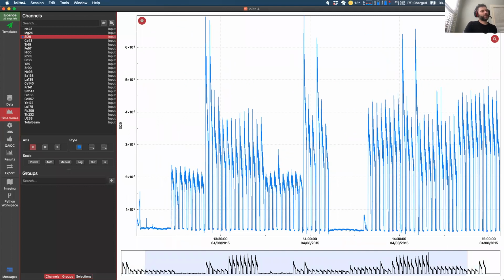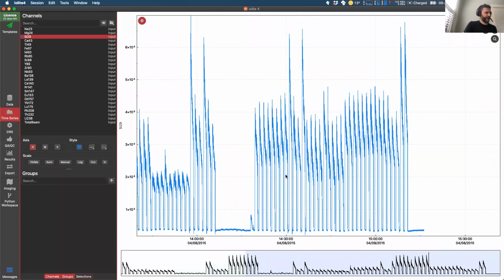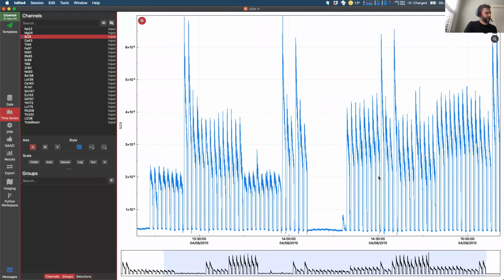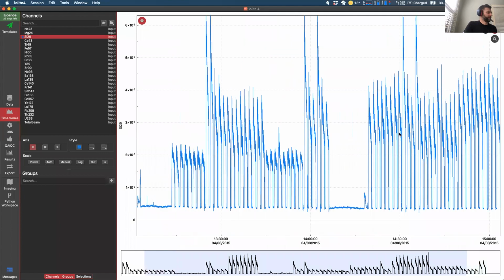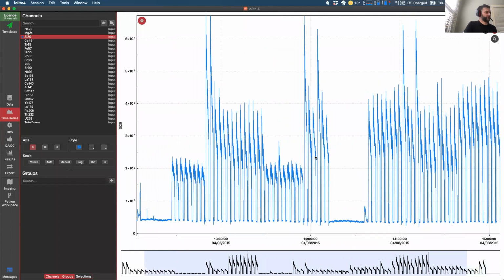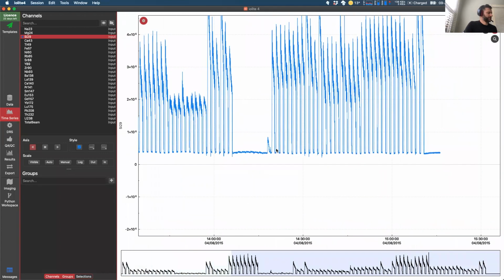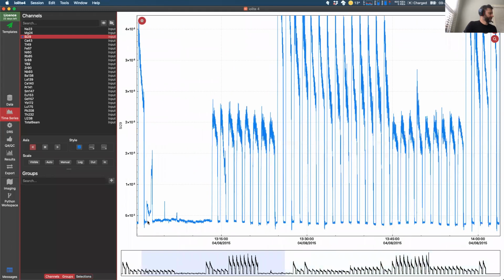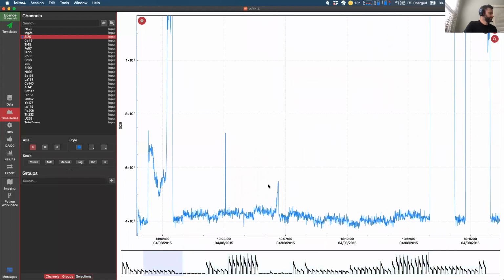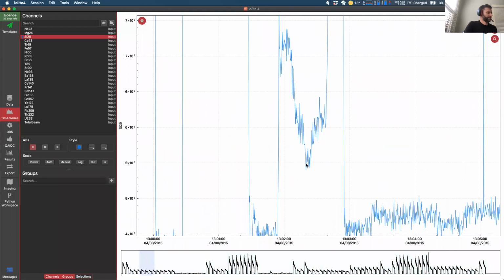It's the same for the grabbers. If I turn on the grab for the horizontal extent and I grab my data and drag it, it only moves in the horizontal extent. And the same for the vertical, it only moves in the vertical extent. But if I turn them both on, I can drag in both senses. This is a really quick way to zoom in on particular data. So you can grab and drag, and you can zoom in on anything that you like.